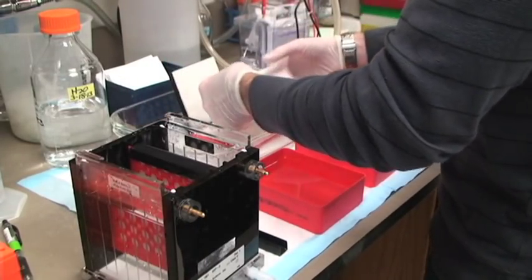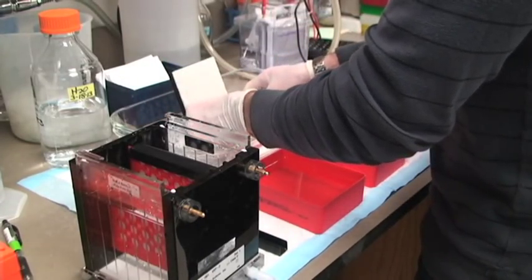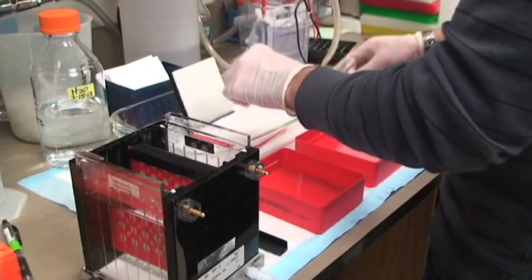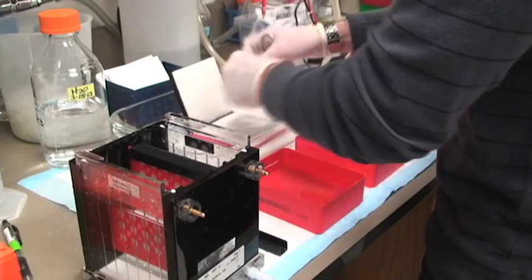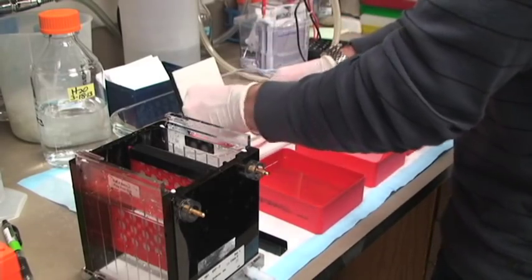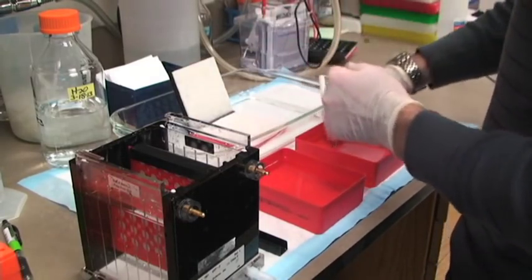You can see that Larry is using a roller to remove bubbles from the sandwich. What happens if you get bubbles in your transfer? They actually prevent the protein from going through, so it looks like there's just a blank space. And it's ugly.